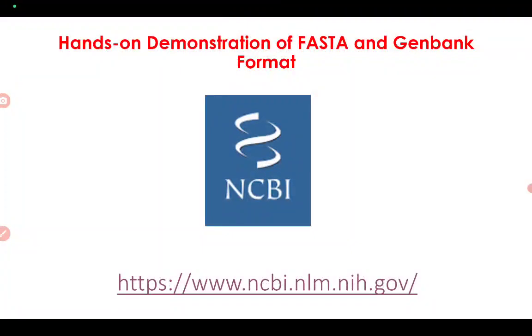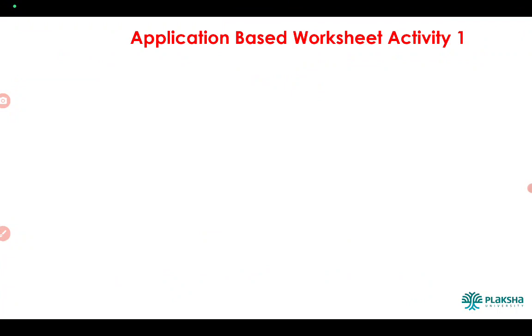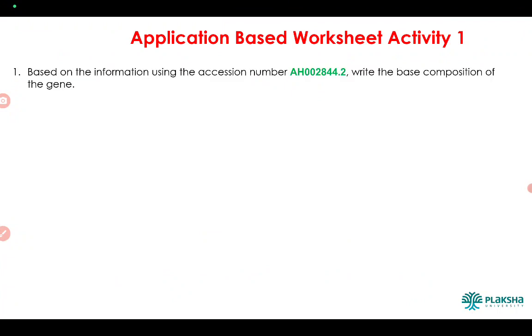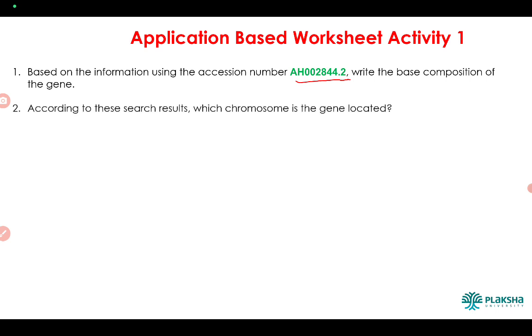This completes the hands-on demonstration for FASTA and GenBank formats. Now here is an activity. Based on accession number AH002844.2, which I showed for insulin, you have to find the base composition of that particular gene — meaning how many base pairs are present. Write your answer in the comment section. The second question: according to this search, on which chromosome is this gene located?